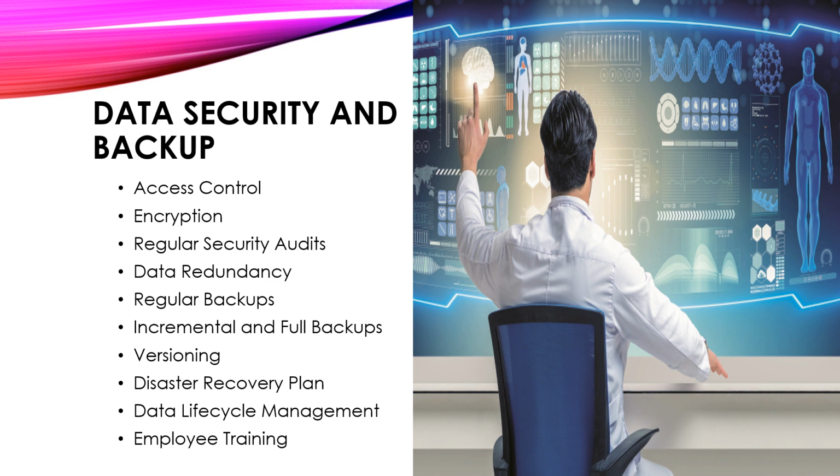Incremental and full backups. Use a combination of incremental and full backups to optimize backup processes and minimize storage requirements. Incremental backups only capture changes made since the last backup, while full backups create a complete copy of the data.